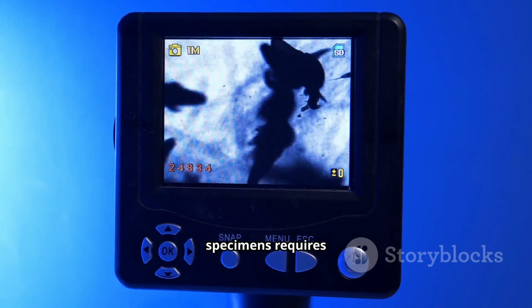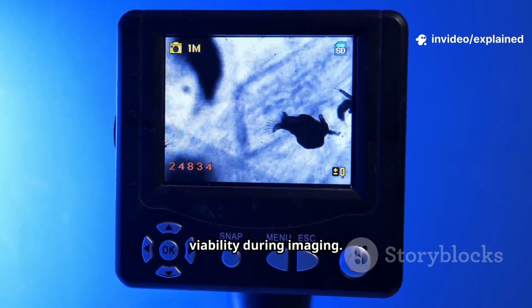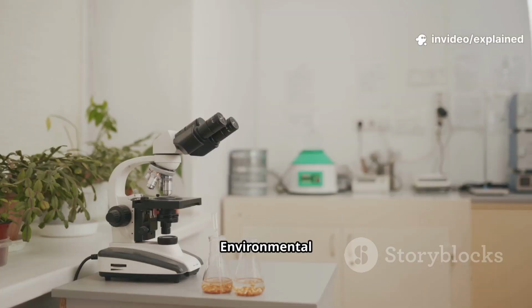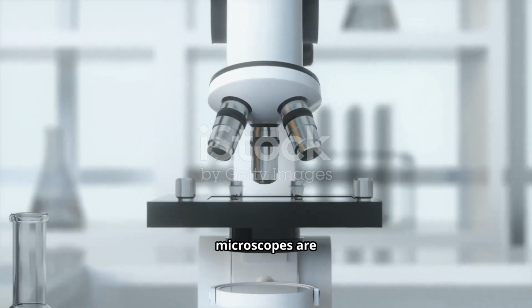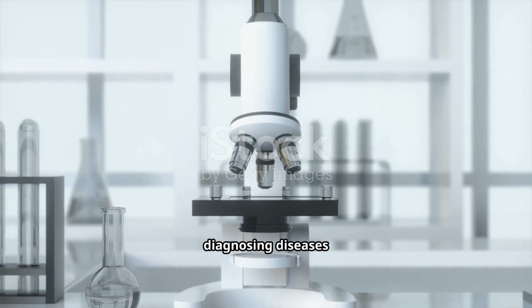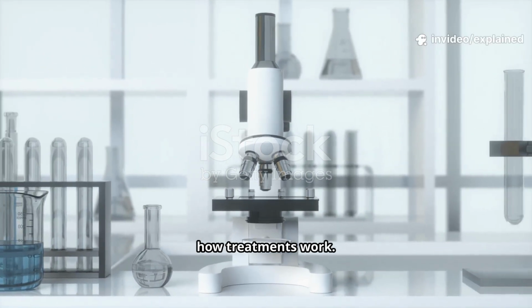Observing living specimens requires special techniques to maintain cell viability during imaging. Environmental chambers control temperature, humidity, and gas composition for long-term live imaging. In medicine, microscopes are essential for diagnosing diseases and understanding how treatments work.